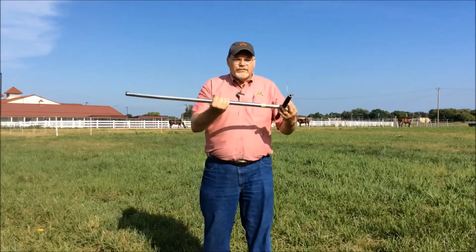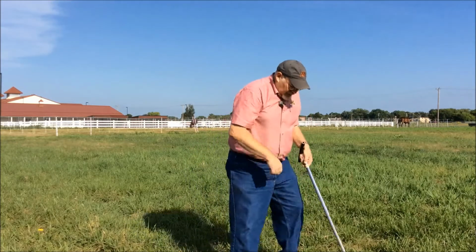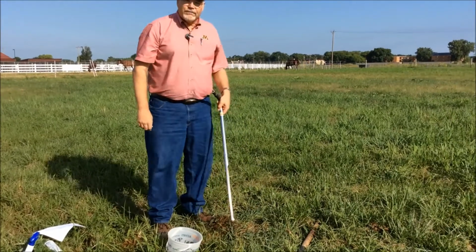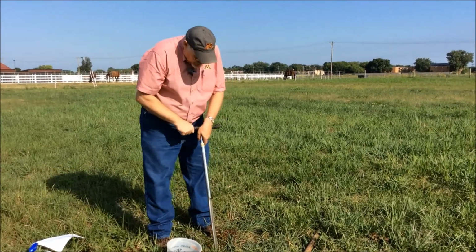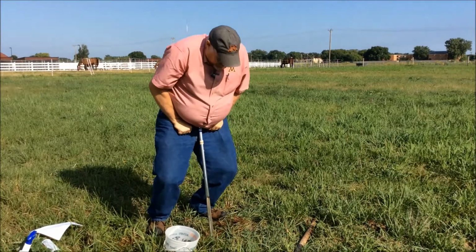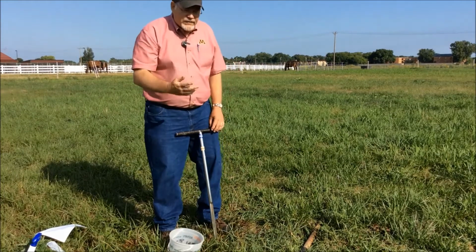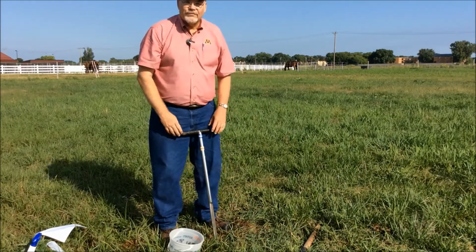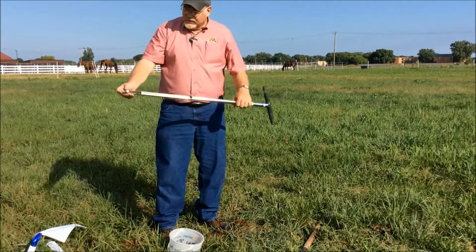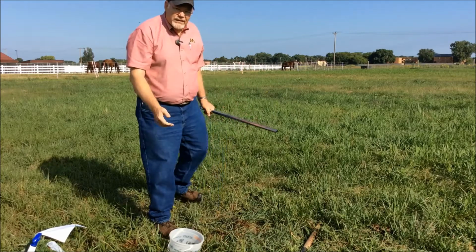So let's just take a few cores here. What I usually do, I like to use a probe. You scratch off the duff layer on the surface. You put the probe down on the ground, and when it's dry, you have trouble getting it deep enough. At the time of this YouTube, we're in the dry August, and it's a little tougher. So you pull it in, you can see I only got about 3 inches in that. You would discard that probe because it's not the depth you want.